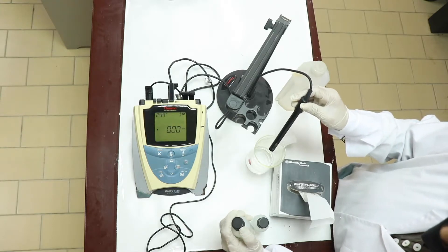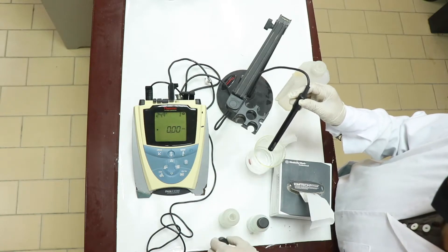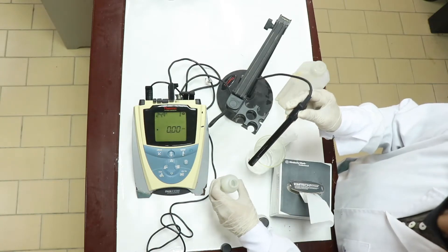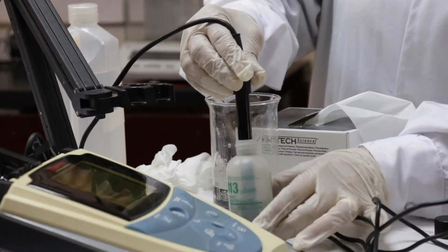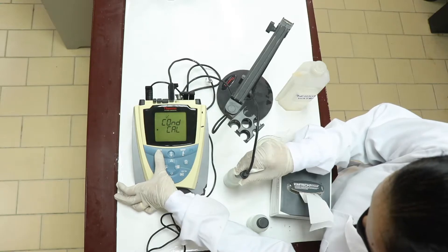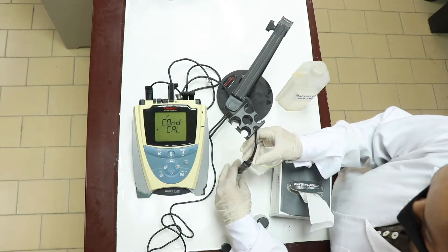Open the 1413 bottle. This solution's conductivity we already know. Now, dip this glass electrode into the solution and you have to press calibrate. Look at the screen. What is appearing? Conductivity calibration.